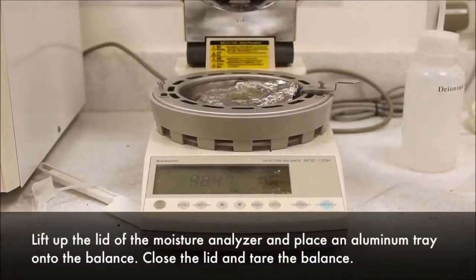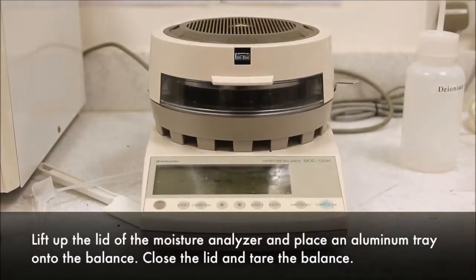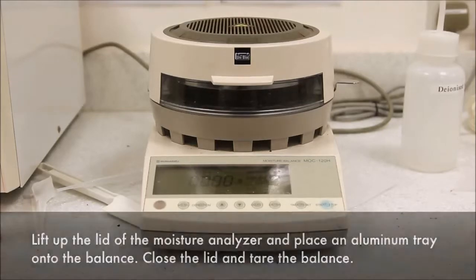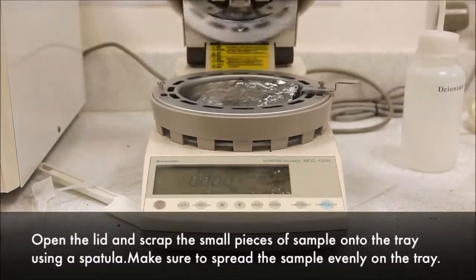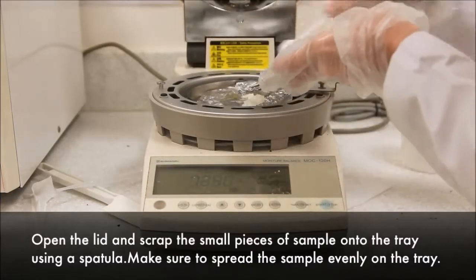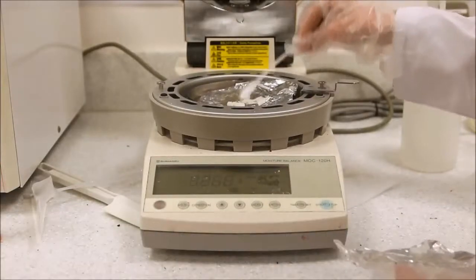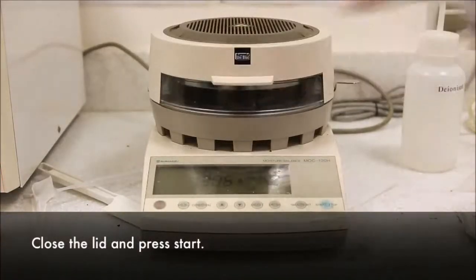Lift up the lid of a moisture analyzer and place an aluminum tray onto the balance. Close the lid and tare the balance. Open the lid and scrape the small pieces of sample onto the tray using a spatula. Make sure to spread the sample evenly on the tray. Close the lid and press Start.